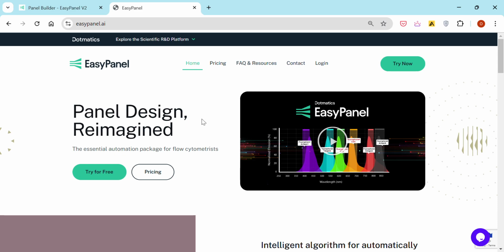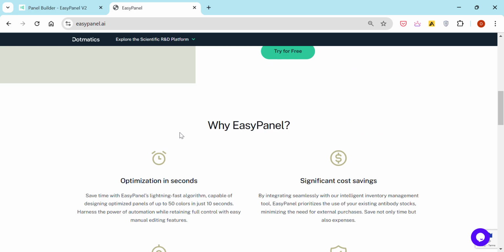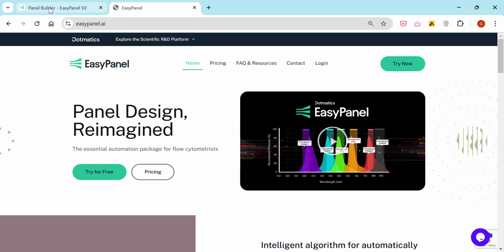I'm the co-founder of EasyPanel, which is an automated flow cytometry panel builder, as well as an inventory management system for antibodies and flow cytometry reagents. This is a short video tutorial about how to use our updated software.